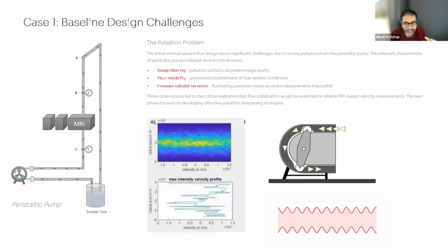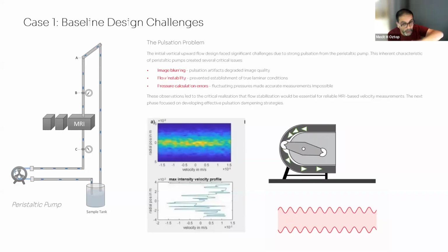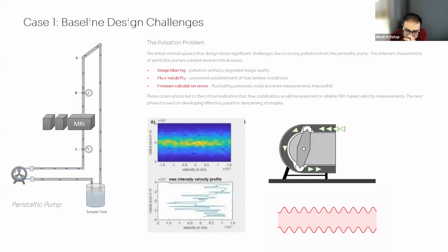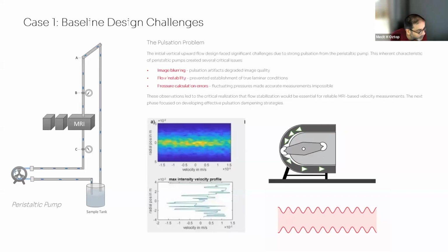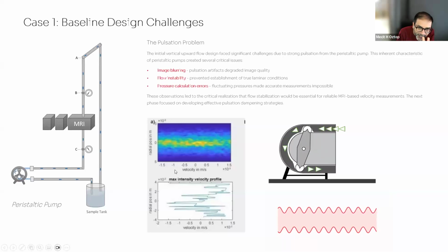So, for instance, here we have the reservoir where we can easily add gastric juice and let the fluid conditions change so that it will have another rheological behavior. But without that, we cannot do that in a syringe pump. It was a challenge. So for the slow flow rates, we wanted to use a peristaltic pump. That is one of the first engineering challenges that we experienced.